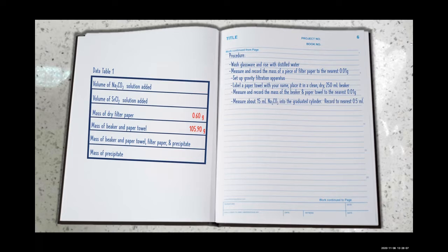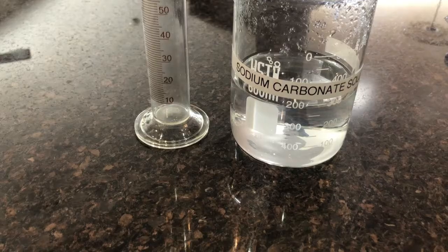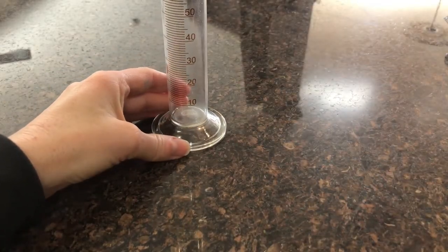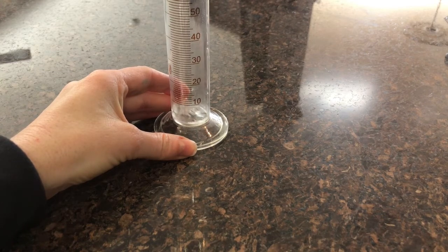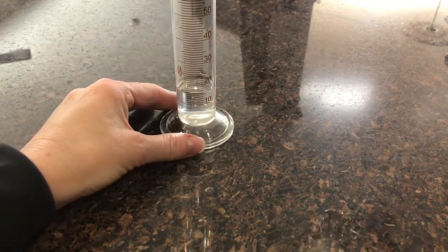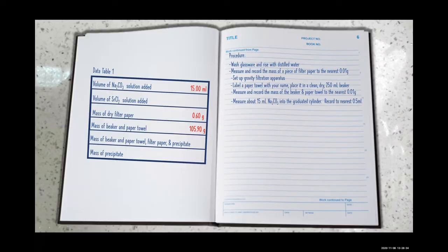Next, we will measure about 15 milliliters of sodium carbonate into the graduated cylinder and record to the nearest 0.5 milliliter. We'll pour the sodium carbonate into a clean, dry 250 milliliter beaker.